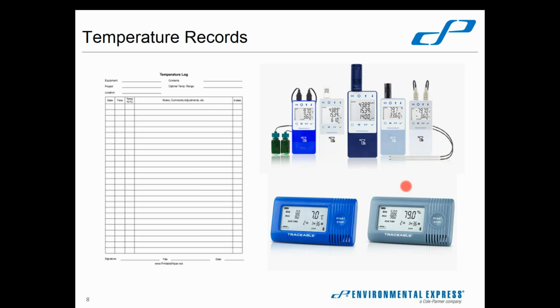So you press start, throw it in the cooler, and it starts recording temperatures. And then you bring it out and you press stop, and then it's got Bluetooth connections to the same type of app as the Traceable Live, and it will then download the temperature records for that period that it was active. And you can use that as temperature compliance type processes for your sample receipts.